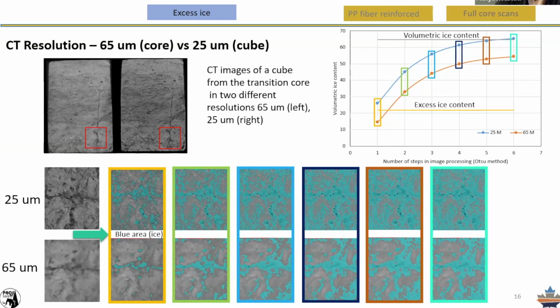We were talking about this a while ago with Wayne. It would be perfect if we can just go for scanning lots of cores, to increase the number of scans we have and maybe make a database of the visual. We cannot talk about the 3D one.